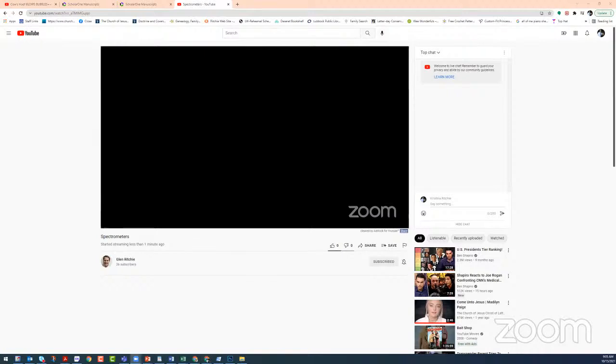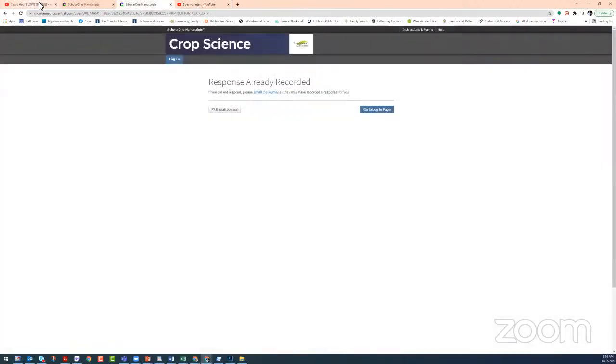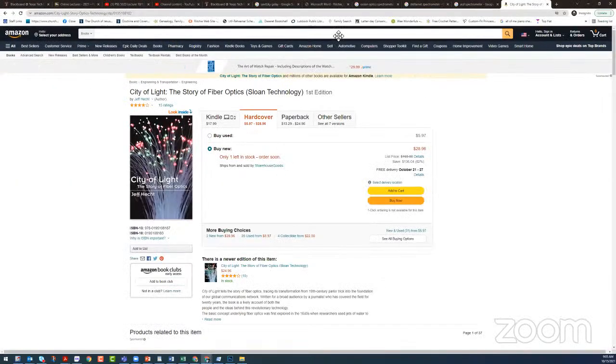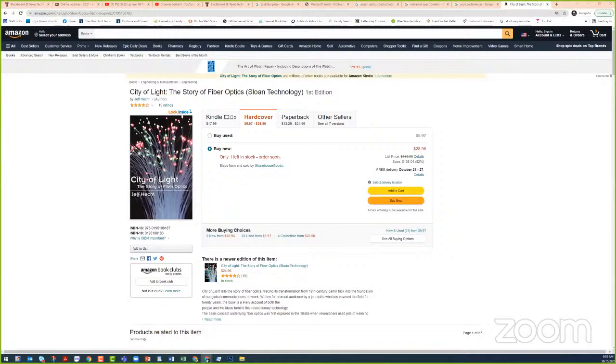Today I'm going to talk to you a little bit about spectrometers, and let me see if I can hide this a little bit here. I thought it would be interesting to walk through a couple of interesting things related to spectrometers and to talk a little bit about the use of derivatives and the use of smoothing in terms of spectral curves. This is something that can be applied to several different types of research, not only spectral research, but anything that has data that could be considered continuous and tends to have a lot of information associated with it.